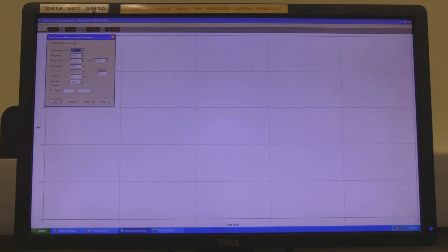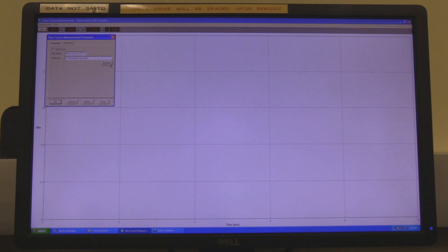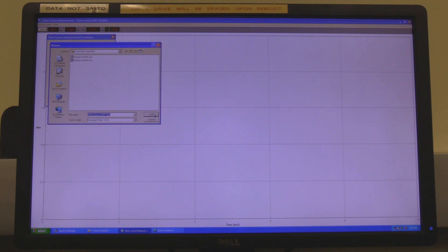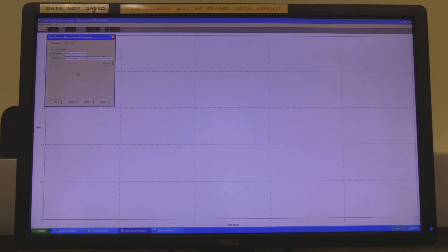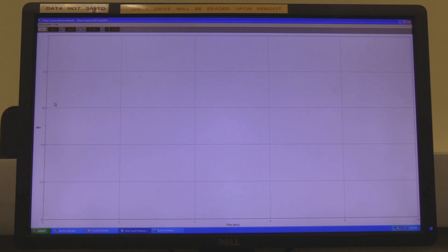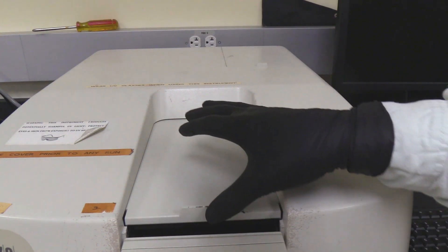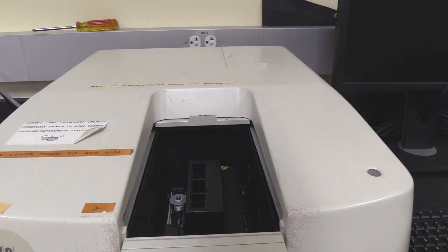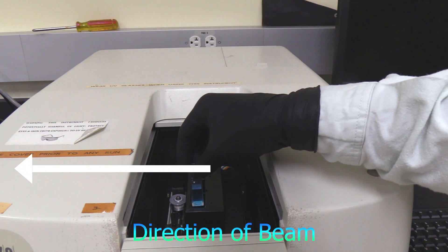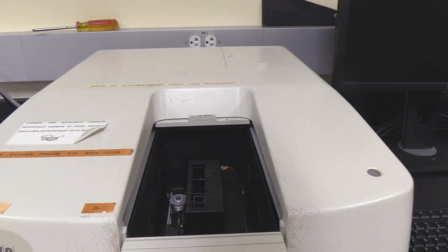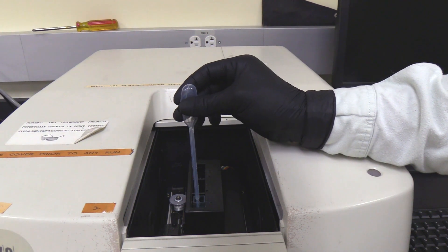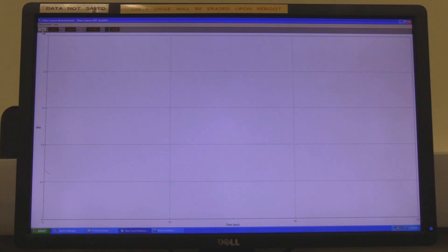Click on the data file tab. Check the autosave box if desired. In file name, input a name for the measurement. Click on browse to select the folder to save data in, find the desired folder and click on save. Click ok to set the setup parameters. Click on measurement and then click on auto zero. Place a cuvette with one part of the reaction mixture in the cuvette holder as described in the spectrum measurement section. The next two steps will need to happen in quick succession: add the other part of the reaction mixture to the cuvette, mix and slide close the lid, then immediately press start.